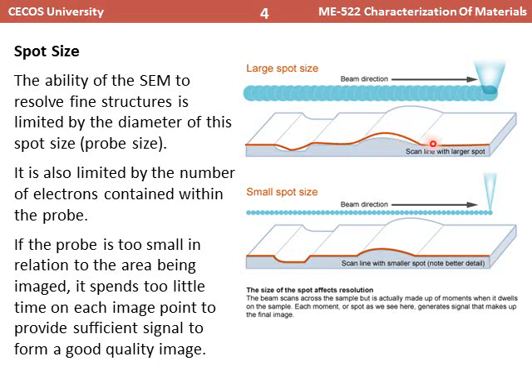If you want to improve your image, or you want to see more in-depth detail, then you have to make the spot size smaller. In the case of a smaller spot size, more time is spent over the line scan. This means the probe size is smaller and more time is spent over the entire line scan.